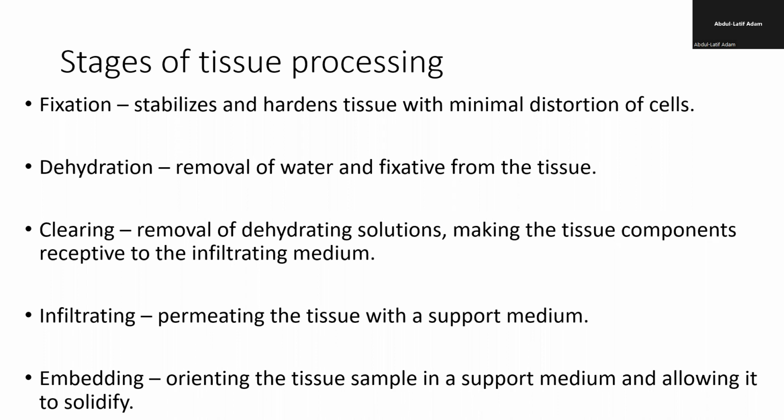As you know already, the tissue is stored in wax, and wax is not miscible with water. There is no way wax and water will mix.